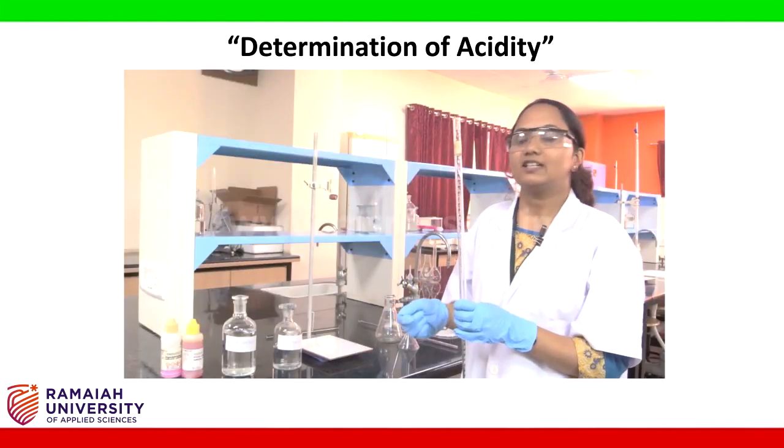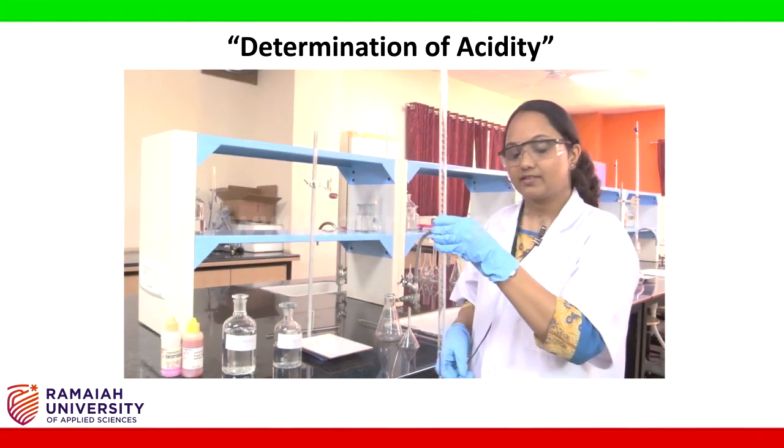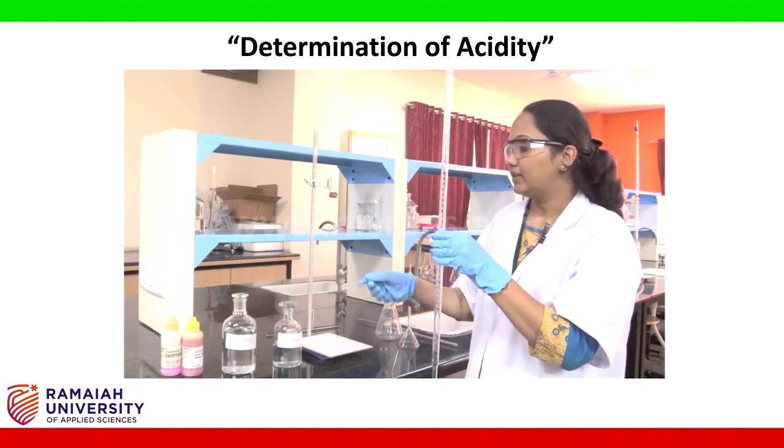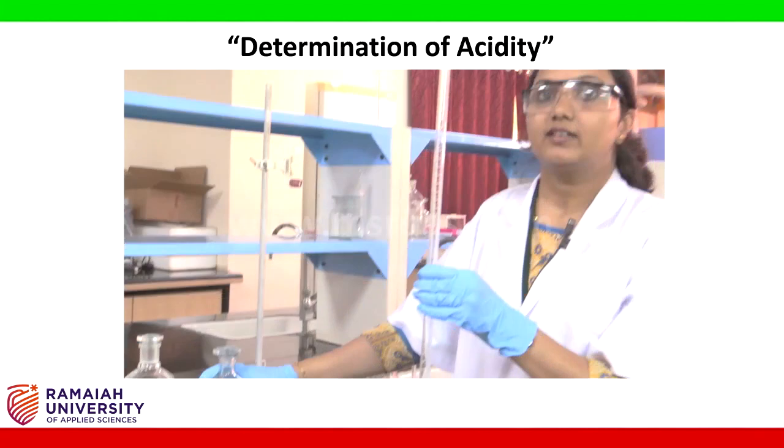After rinsing all the glasswares with distilled water, we have to rinse the burette with the standard NaOH, that is 0.1 normal sodium hydroxide.